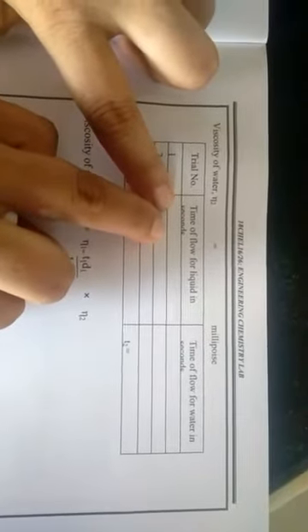Now I will be recording it. See here, experiment number 11 is determination of coefficient of viscosity of a liquid. In the tabular column, time of flow for the liquid in seconds, I will be writing 61 seconds. Then again I suck the liquid and note down the time. I do 3 trials, take the 3 readings, and take the average.